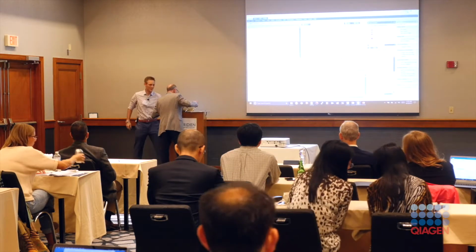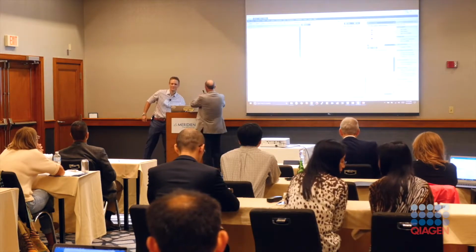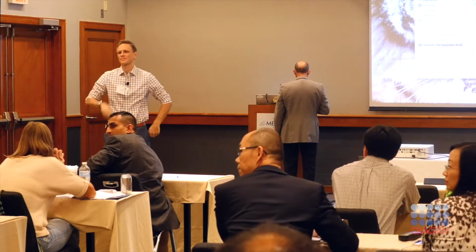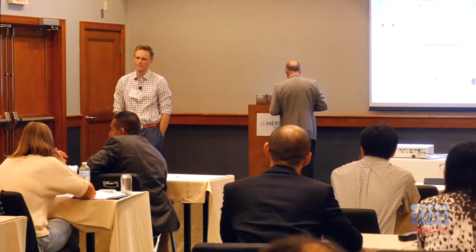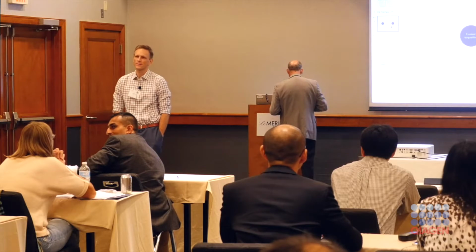While Jean-Noel gets set up very briefly, do we have any questions on the first half? No, we're good. Yes, PJ. I noticed you did something that many people do. You first go to quality mode instead of speed mode, and then you get rid of the squares and make it circles, and then you size by p-value. Is there a way to make that a default or a simple click? Because that ends up being, at least for me, those exact same 3 clicks every single graph.